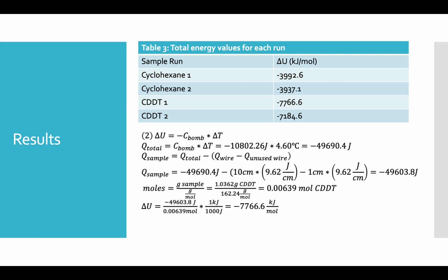Additional steps are taken in the sample calculation to account for the portion of the fuse that burns and gives off energy at 9.62 joules per centimeter. The final calculation is presented in kilojoules per mole.